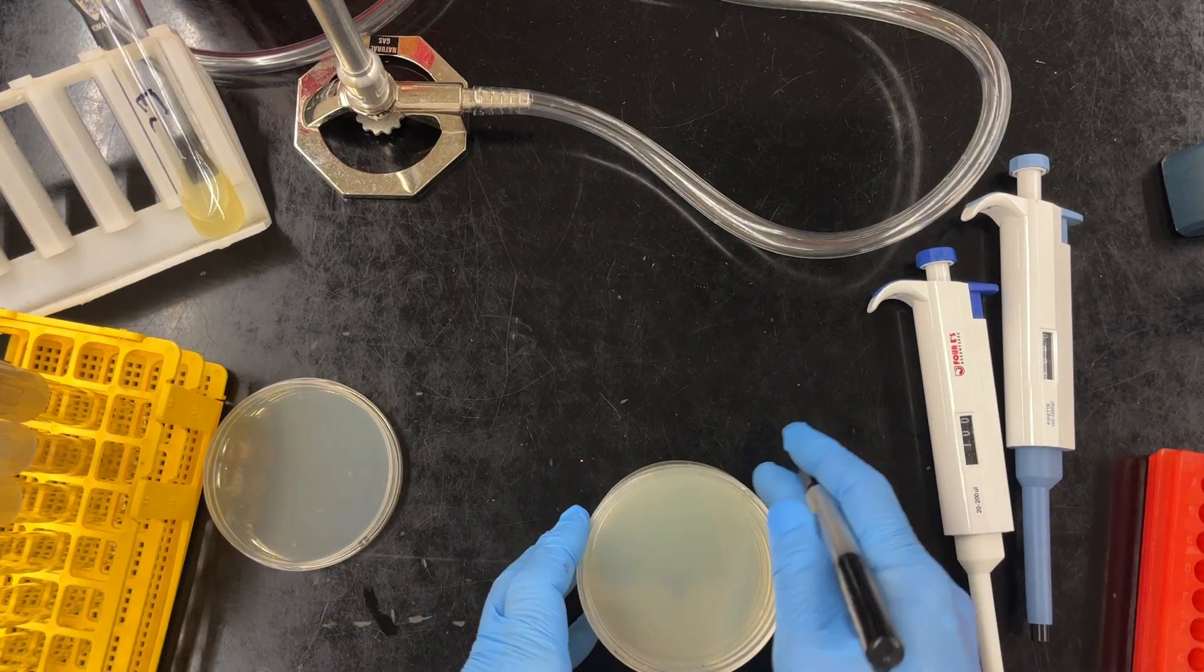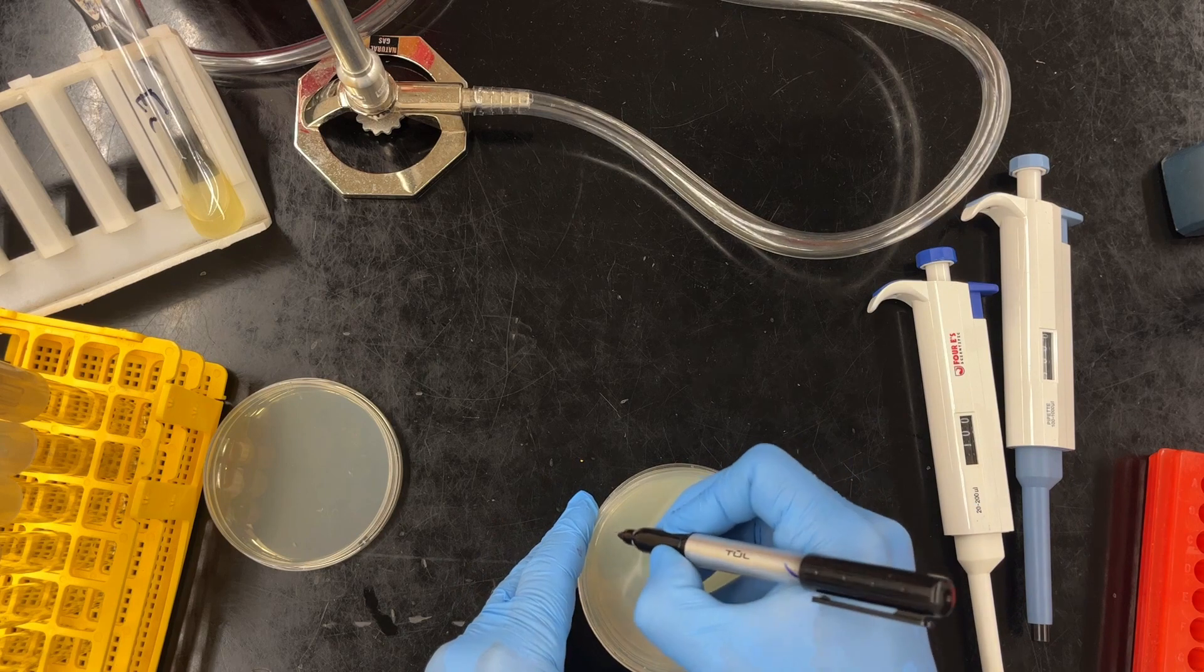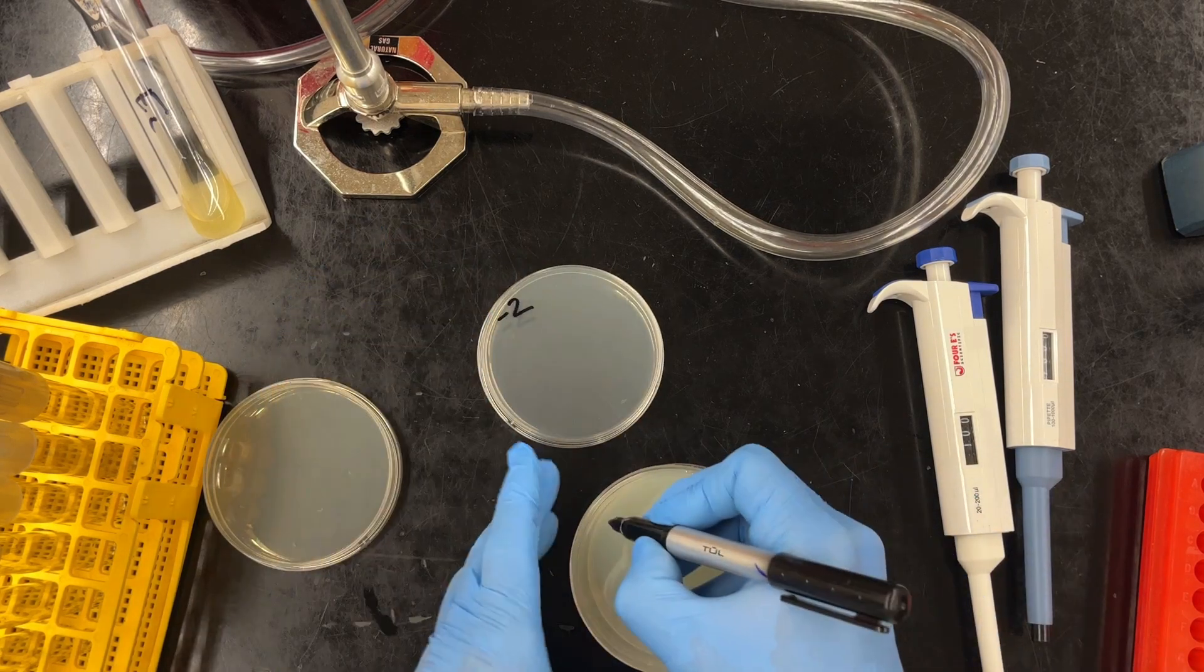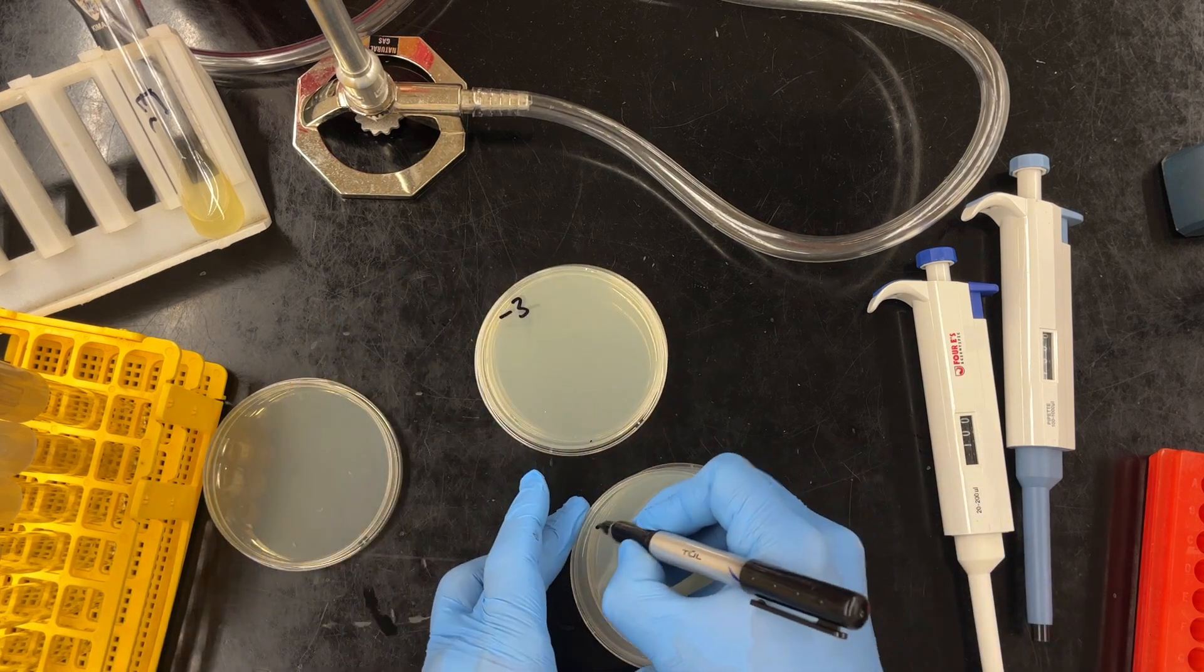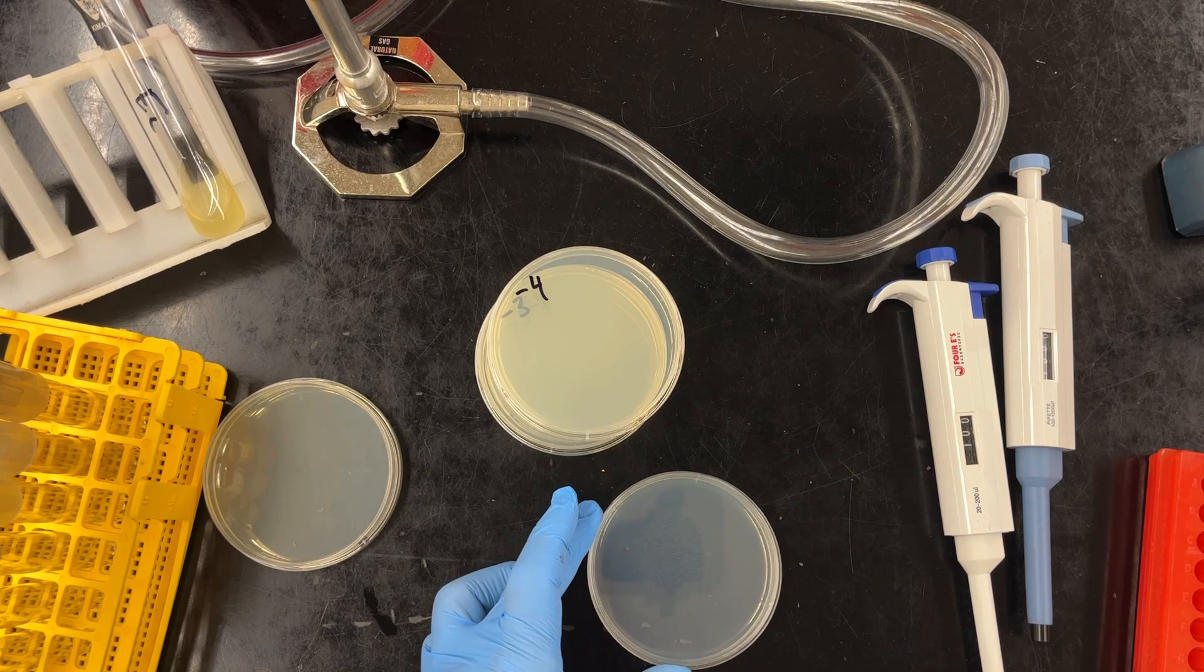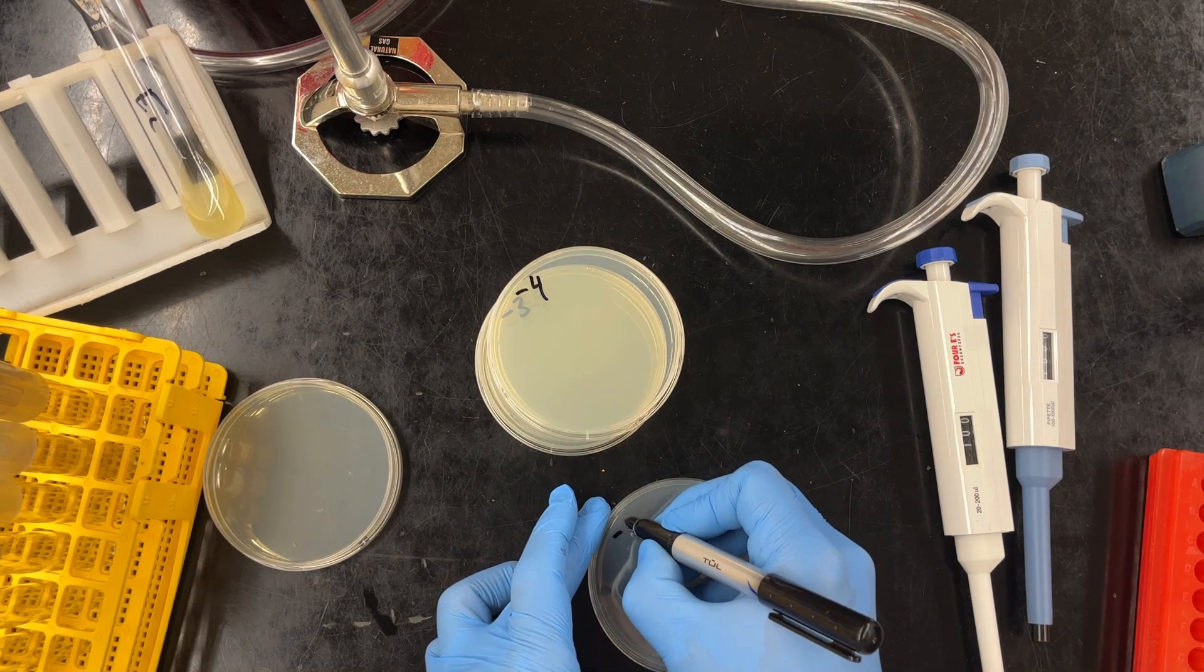Now in the past, when we did standard plate counts, we labeled our plates with the dilution that the samples were coming from. But in this case, what we're going to do is we are going to label with the final dilution. And we'll go over the math in class. And so in this case we're going to plate minus two, minus three, minus four, and minus five.